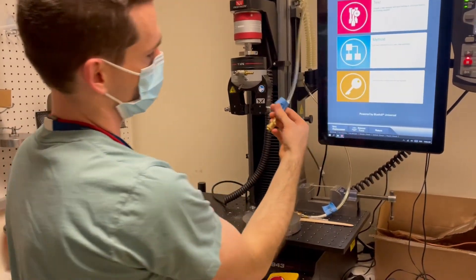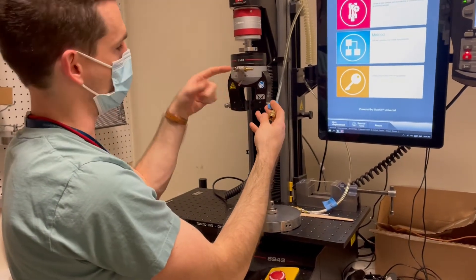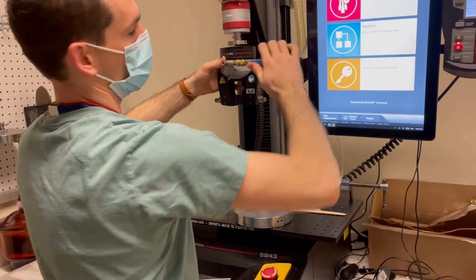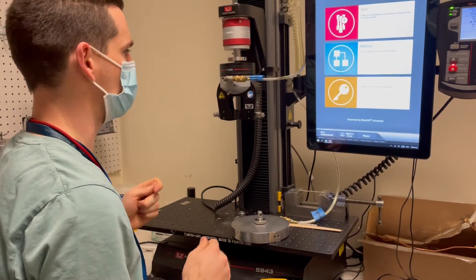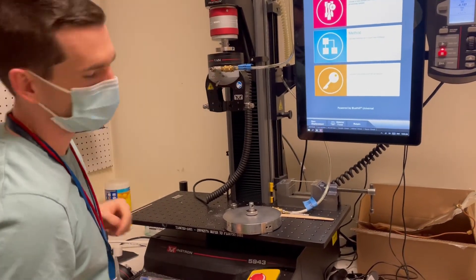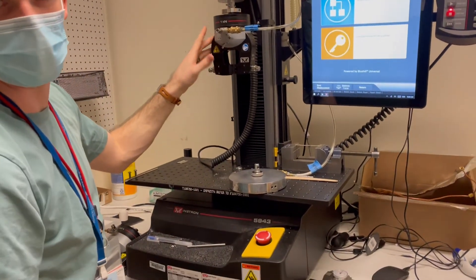You have pneumatic air lines labeled top and bottom. Put the top grip on so that it's facing this way, and just push it on — you'll feel it click; it takes a little bit of force. To close or open it, just flip the switch. The line has been pre-pressurized with the air compressor underneath the table.